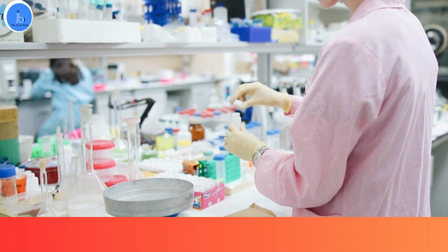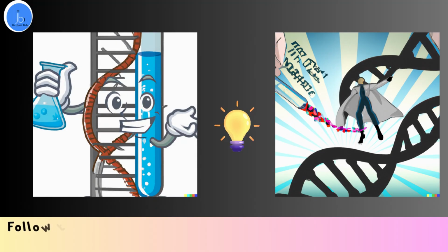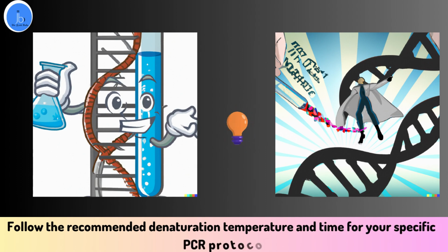Mistake number 4 is inadequate denaturation. It's crucial to ensure proper denaturation of your DNA template. Follow the recommended denaturation temperature and time for your specific PCR protocol.